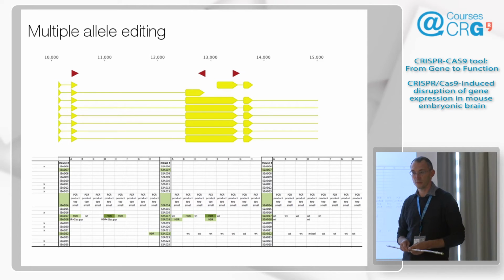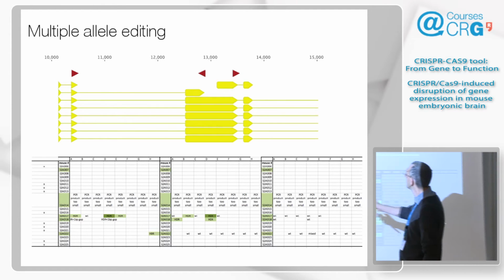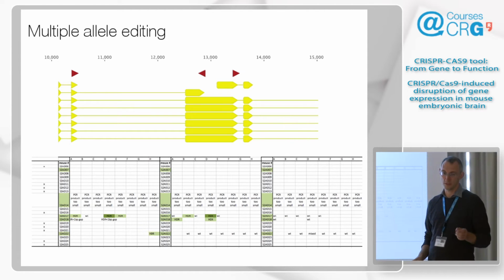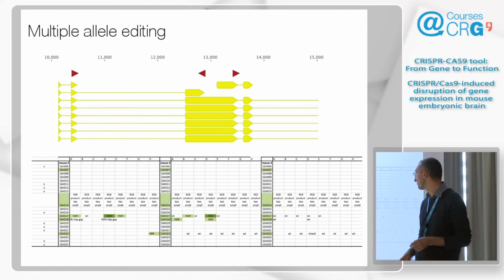potential is. People have demonstrated using multiple guides to do multiple edits at different genes. In this case, it's a little bit more complicated because it's multiple guides on the same gene nearby in the same locus. So this is within, let me see, about 5 kb distance. We had to put 3 edits. So we had guides for each position and a repair oligo for each position.